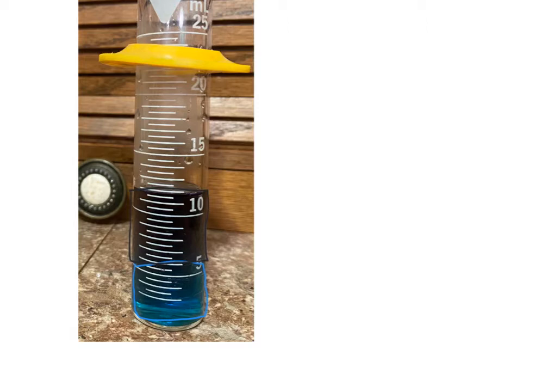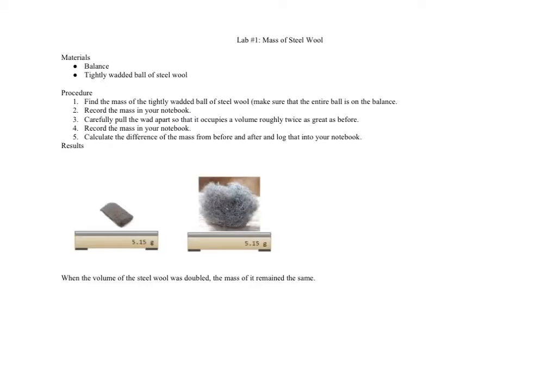You have probably heard that this is related to a property called density. In today's lab, we're going to look at what density actually is, and to do that, there are two other variables we have to look at first. I've got my water, and the first variable that we're going to have to look at is mass.